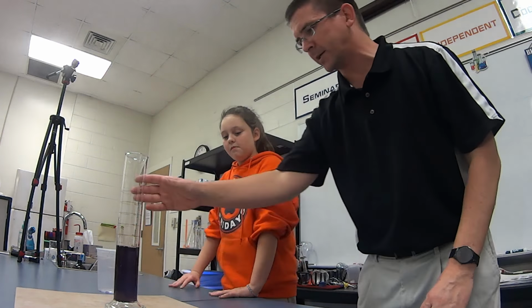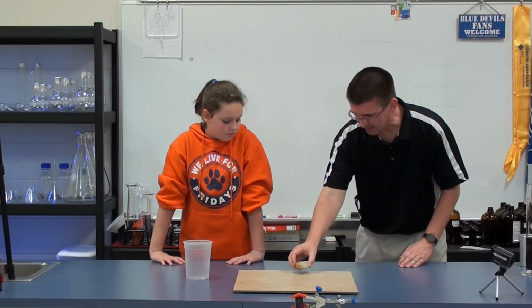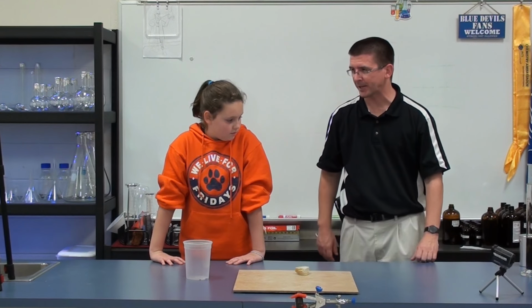So it's really easy to measure a liquid, but where volume measurement gets a little trickier is if I give you an odd-shaped object, something like this rock. Obviously, it's not going to fit in a graduated cylinder and measure volume like we would do with a liquid. So we have to find a different way to do it. And the way we can do that is through a process called displacement.